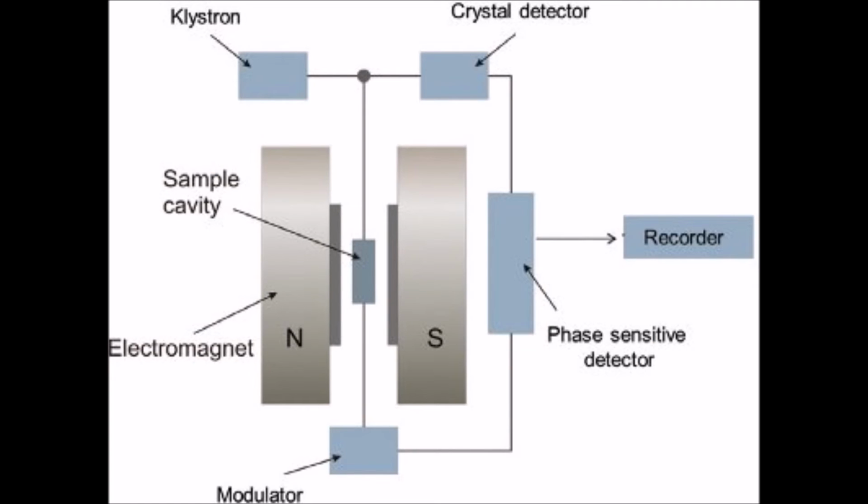Electron spin resonance spectrometers are composed of four essential components: a monochromatic microwave source, a waveguide for guiding the microwave power to the sample, a cavity designed to ensure proper coupling between the sample and the incoming wave, and a detector for microwave power to detect the response of the sample to microwave irradiation.